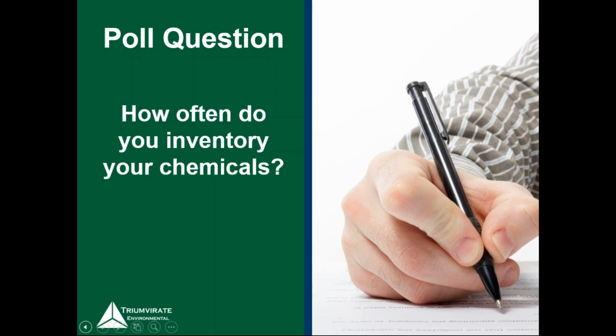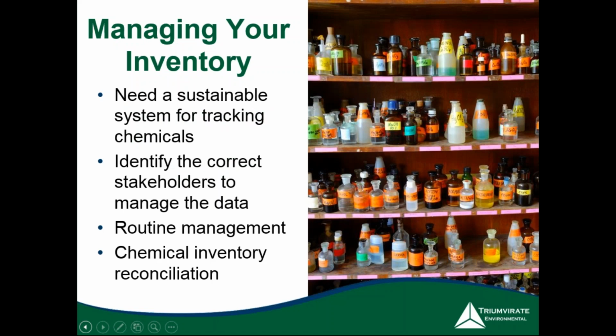This is really a safety and compliance thing. And if you can do it more than that, even better, but at least once a year is what I would suggest, depending on what your constraints are. And obviously, everybody's situation is a little bit different, but annually should be what you're shooting for if possible.